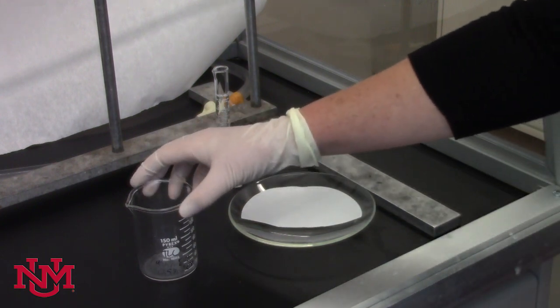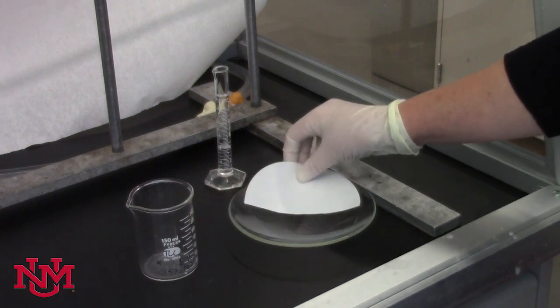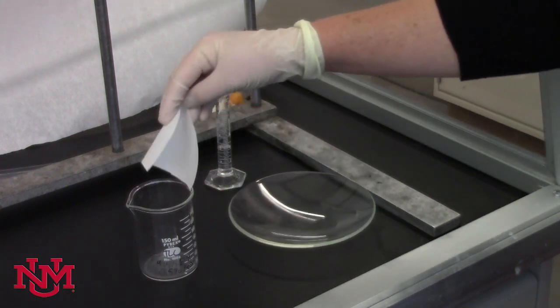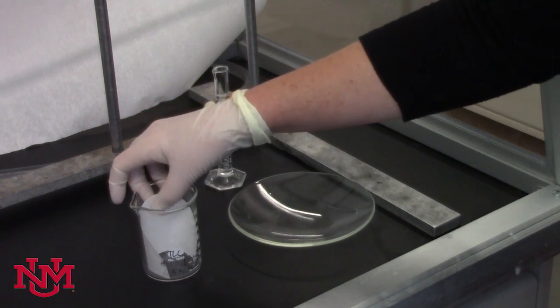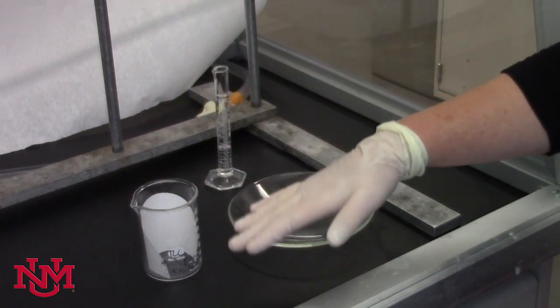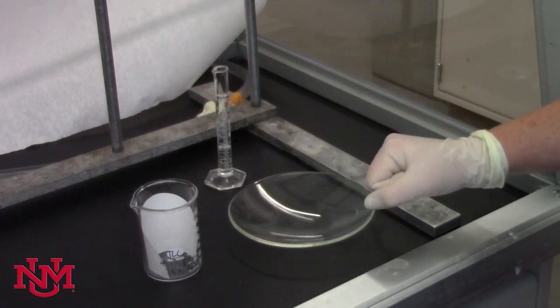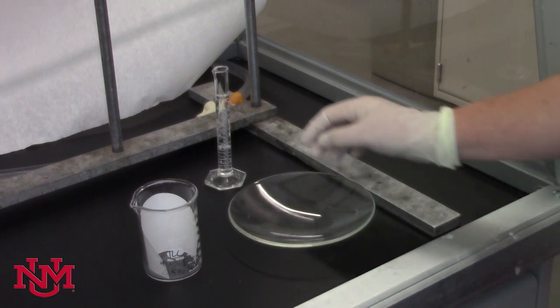You'll need a 150 ml beaker and a piece of filter paper. We're going to use that to line the beaker so that we can get the solvent to wick up the filter paper through capillary action and saturate the atmosphere.